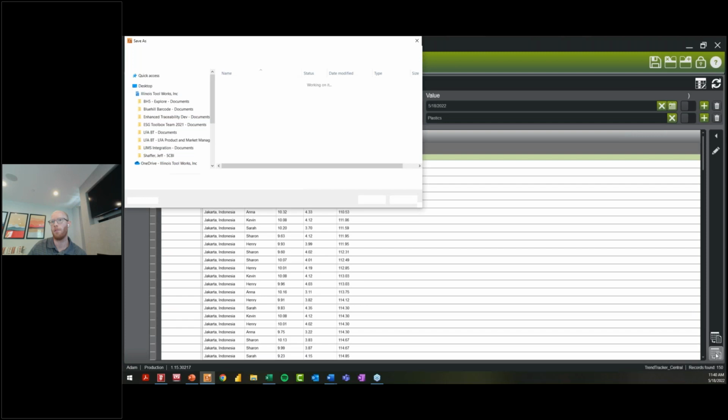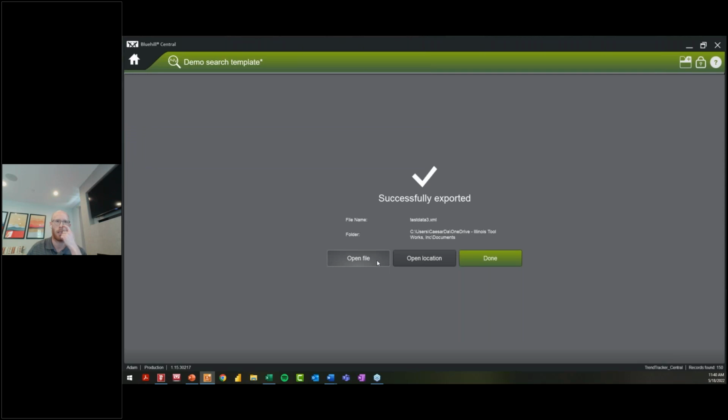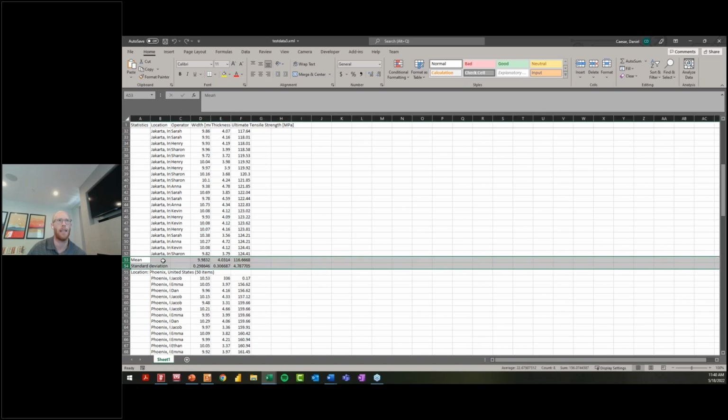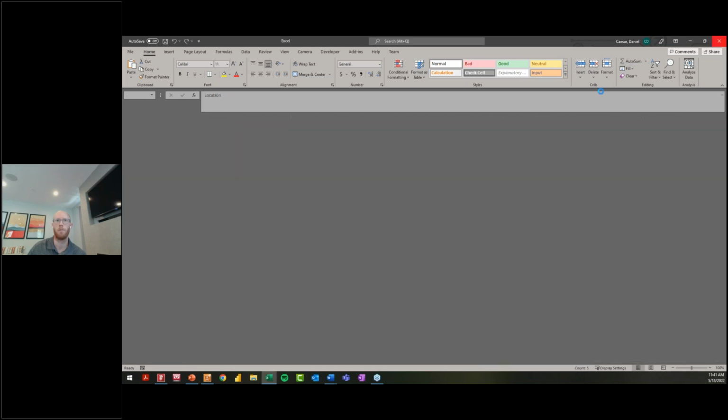And then the benefit of going to Excel, which is the other option, so it goes into an XML spreadsheet that is opened up in Excel, is that you actually retain some of the formulas that are used. So if I open up the Excel file, not only do I have this kind of fixed column header that's automatically generated, but if I look at those calculations, this is the statistics that I chose, that's actually using Excel's innate formulas. So a couple of different options for exporting, definitely very useful.